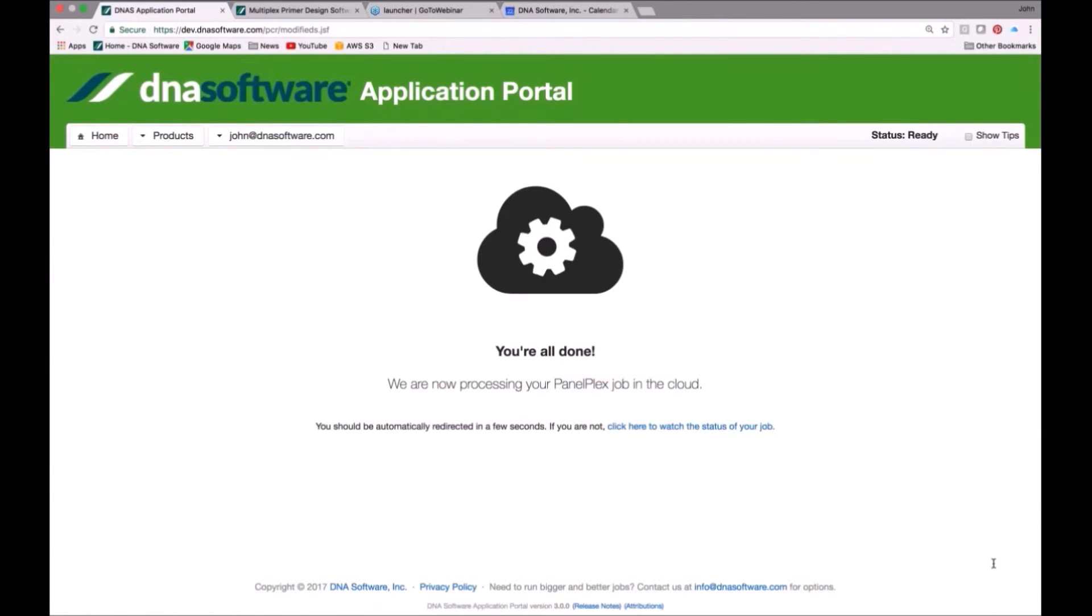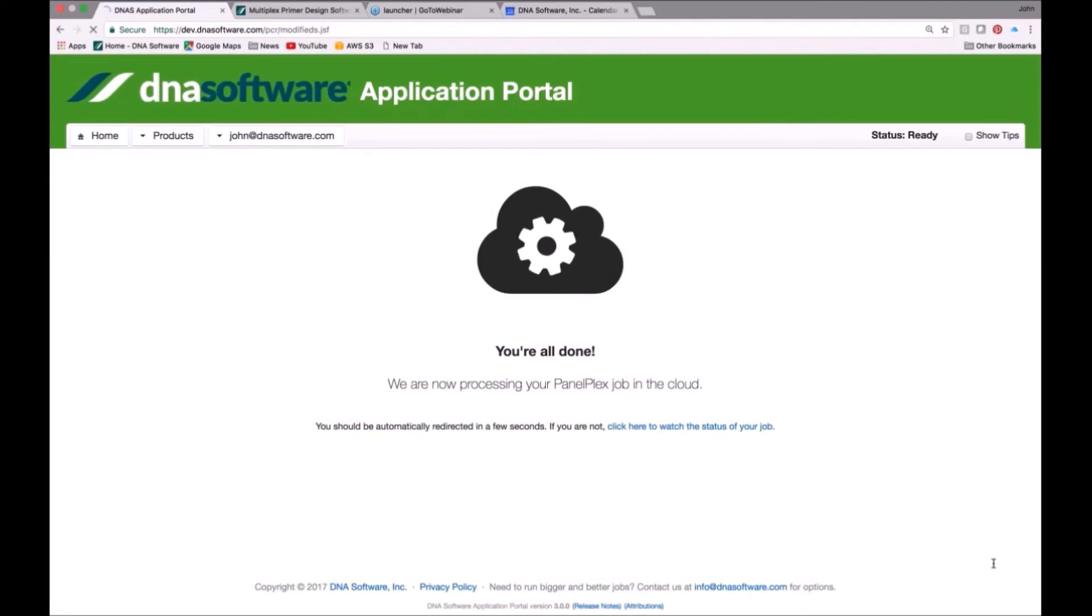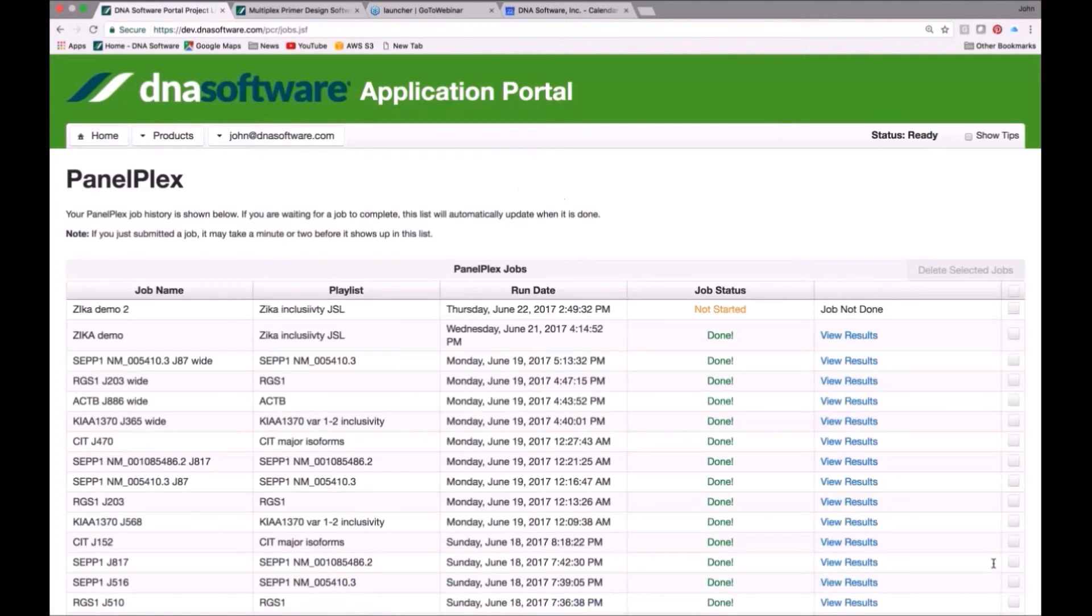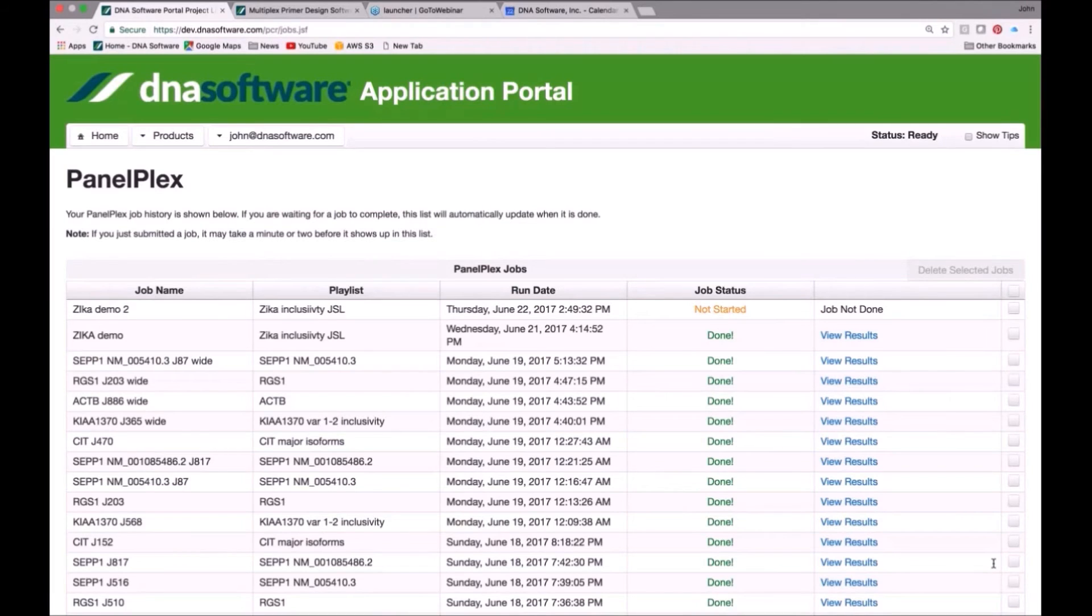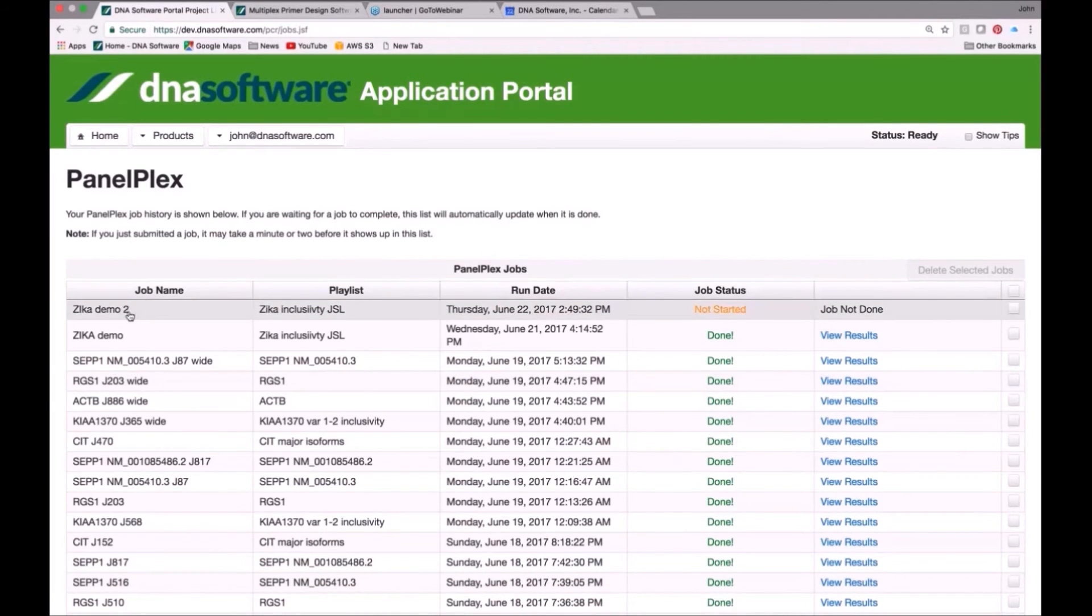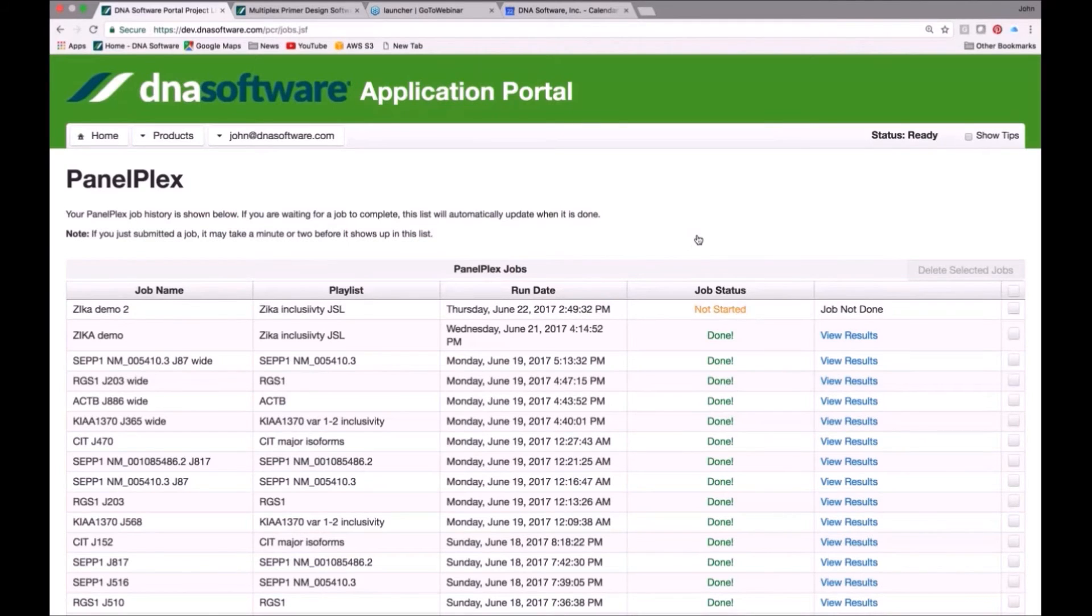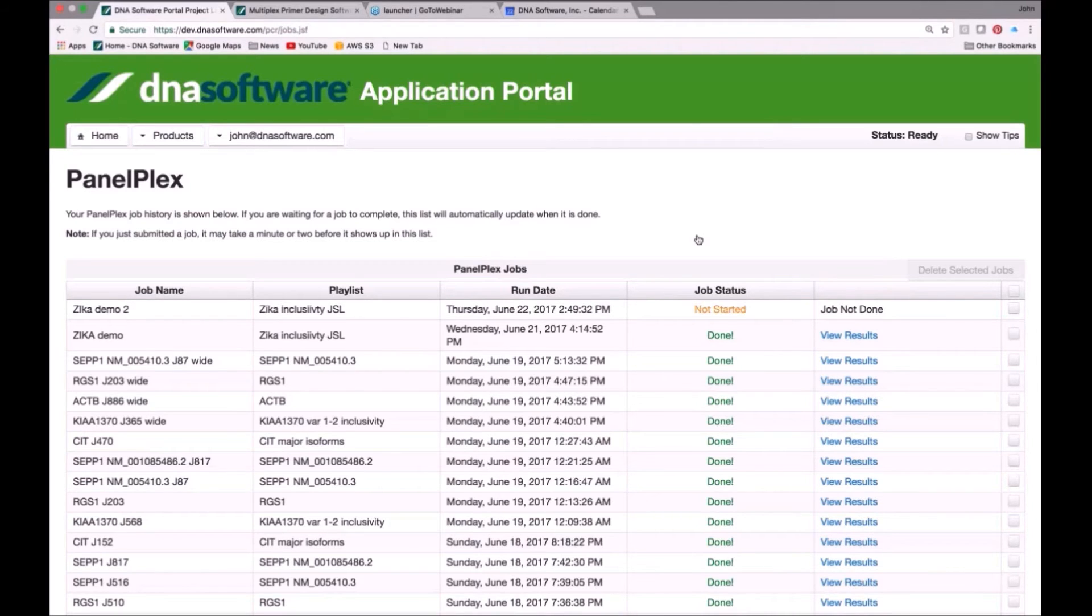At this point, this program is going through millions and millions of computations that are being done on 32 CPUs. You can see the program automatically took us to the results page. And here is the project I just started, Zika Demo 2. It says not started. It takes about 60 seconds or so to spin up a dedicated 32 core instance on the cloud to solving your problem that will crunch away on it until it creates your solution.